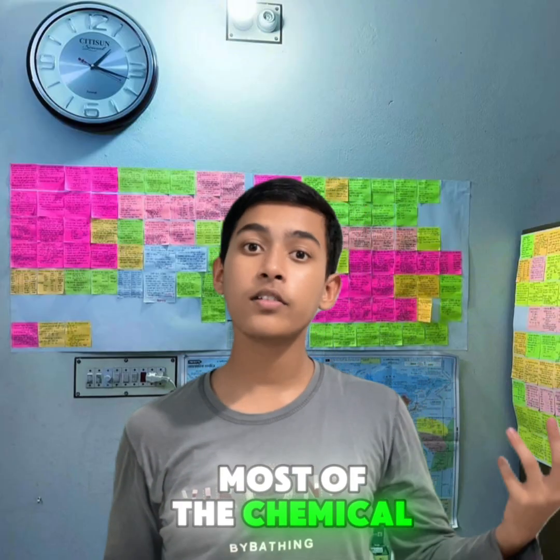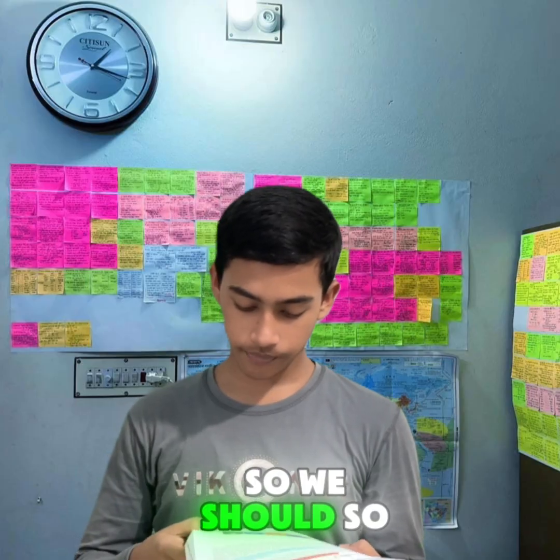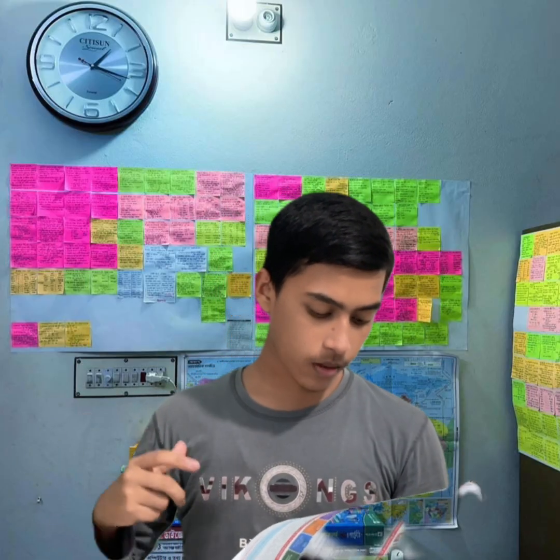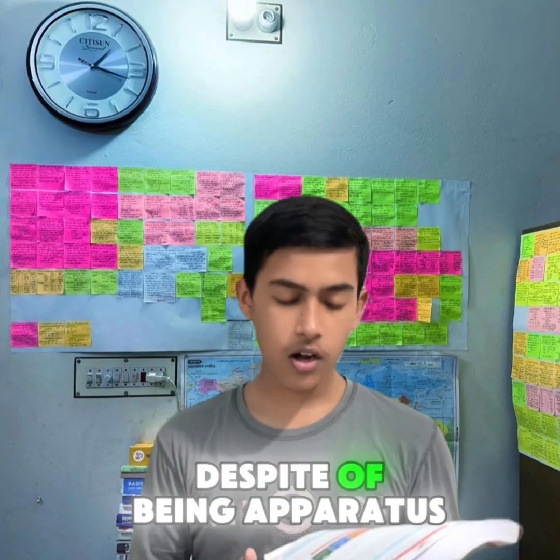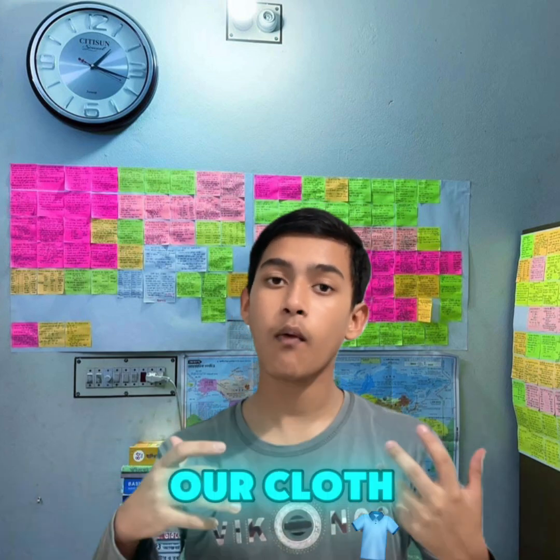Most chemical experiments involve glass apparatus, so we must take precautions while using it. While we do an experiment, chemicals may fall on our friend's body or our clothes.